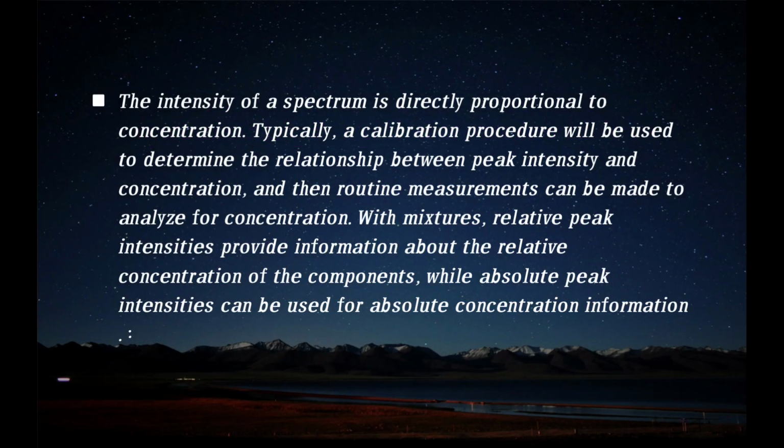The intensity of a spectrum is directly proportional to concentration. Typically, a calibration procedure will be used to determine the relationship between peak intensity and concentration, and then routine measurements can be made to analyze for concentration. With mixtures, relative peak intensities provide information about the relative concentration of the components, while absolute peak intensities can be used for absolute concentration information.